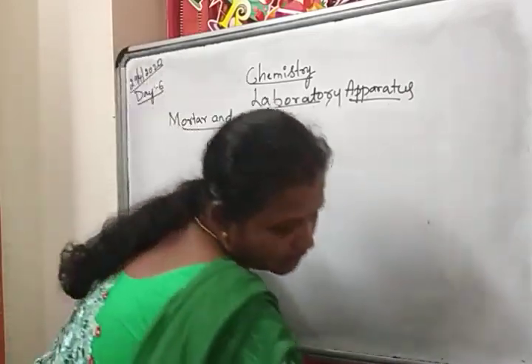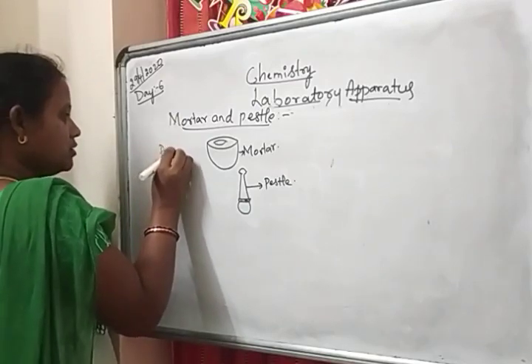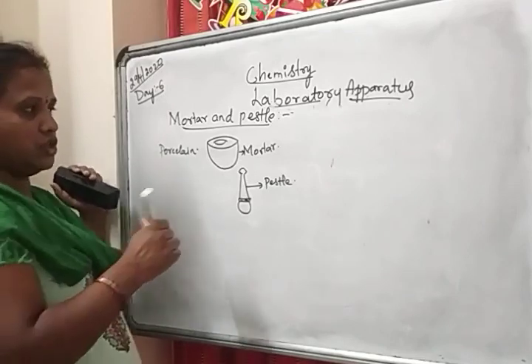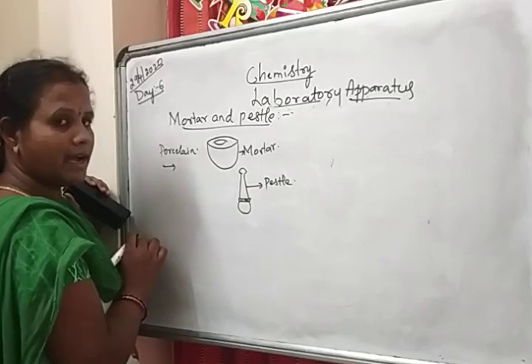So these are made up of the material porcelain. Here, children, porcelain material is used. And then what is the use of this mortar and pestle?